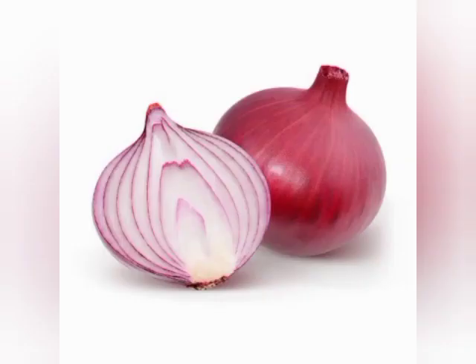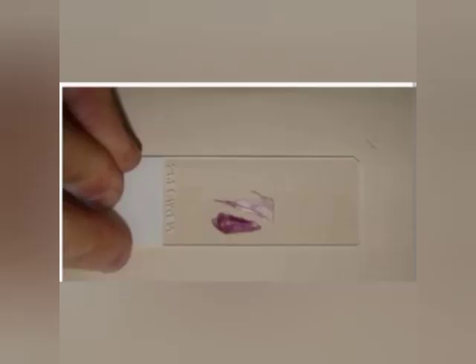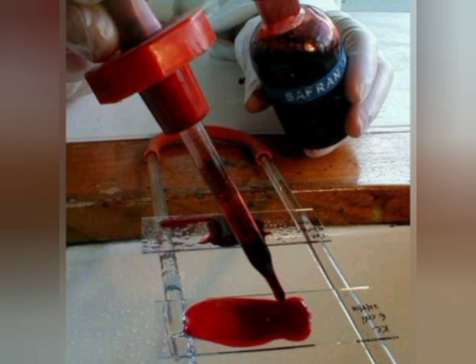Take an onion, cut it, and carefully take one peel of onion by using a forcep and keep this onion peel on the slide. After that, add one drop of safranine onto the onion peel.